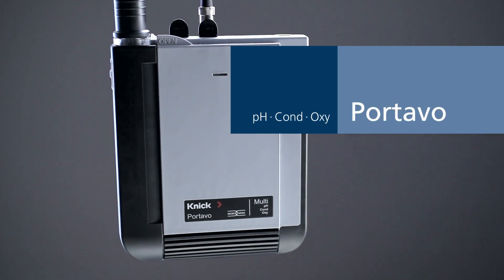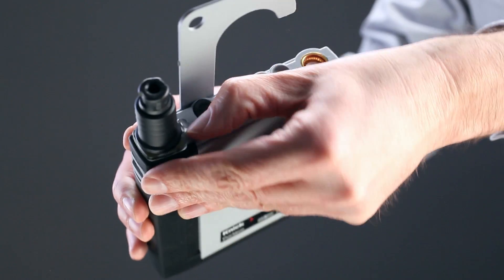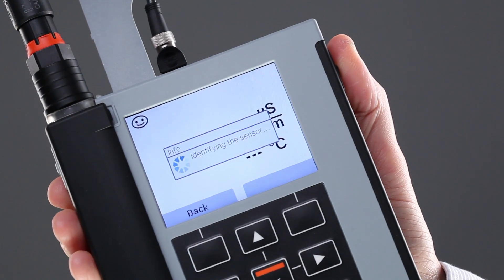Portavo — the first portable for Memosense and analog sensors, with multi-functional hook. The cover can be completely flipped over to the rear. Color graphic display, scratch proof and with high resolution.